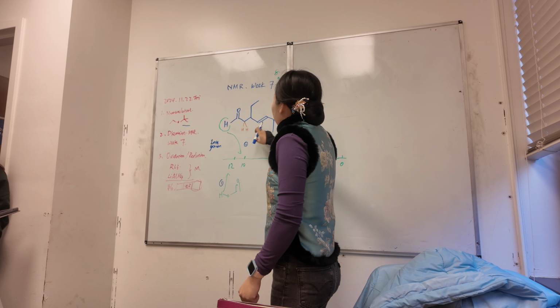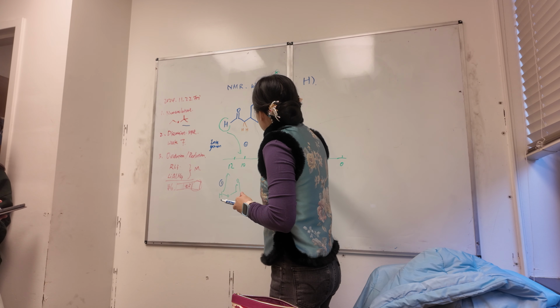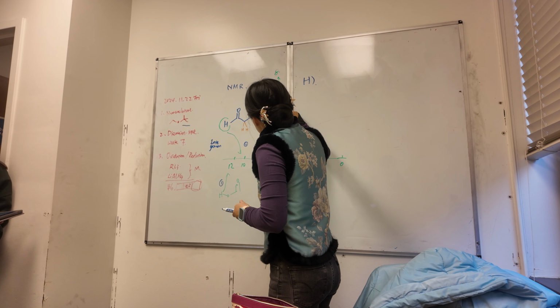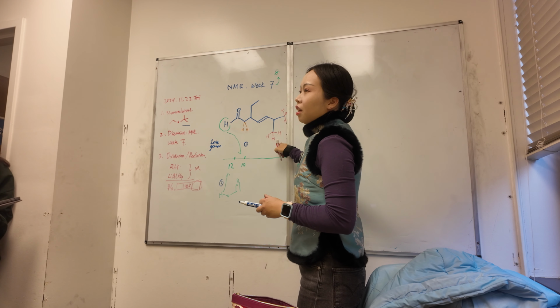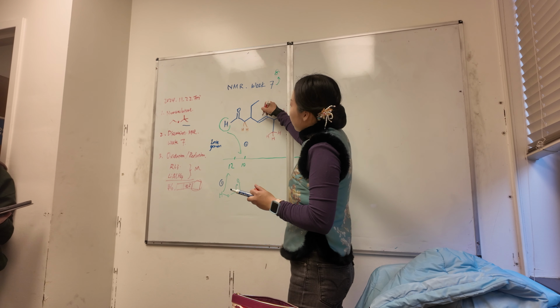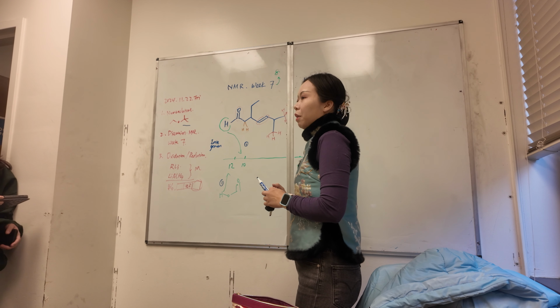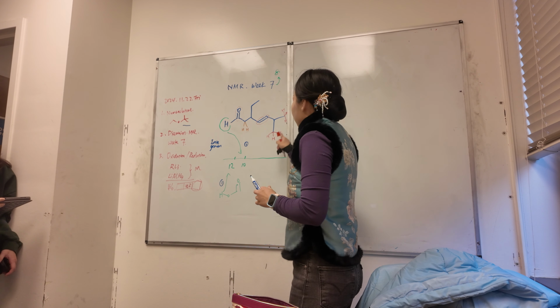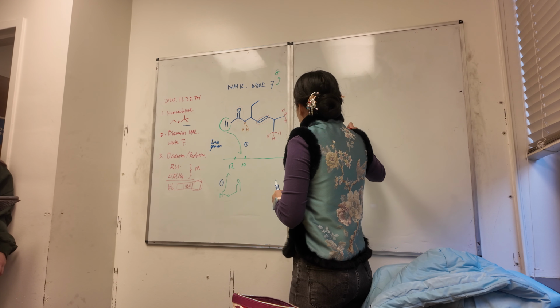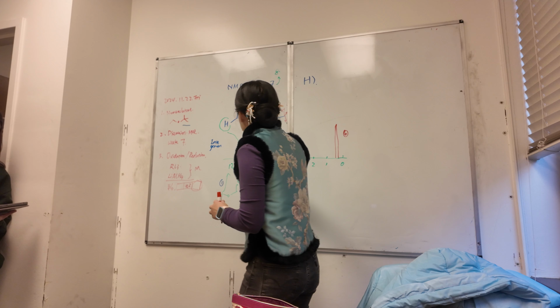Okay, without this carbonyl, let me do this part. This 2 part is without. Okay, these are without, right? This 6 hydrogen, these are without, at least farther away from something that will have some effect on your hydrogen, right? This one will be roughly very close to here, and will have a peak with an integration of 6. Okay, let me actually draw this peak out.